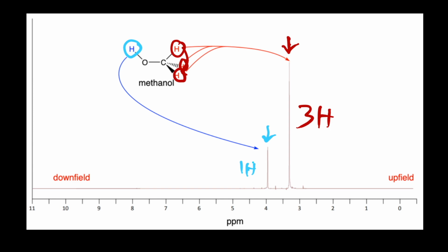peak area. So what we're measuring is the area underneath the peak. Not how tall the peak is, but the area underneath it. And the way we do that, usually in an NMR spectrum, is we ask the computer to measure the area underneath that peak for us. Now we know from math and calculus that the area underneath a peak is the integral of that peak.